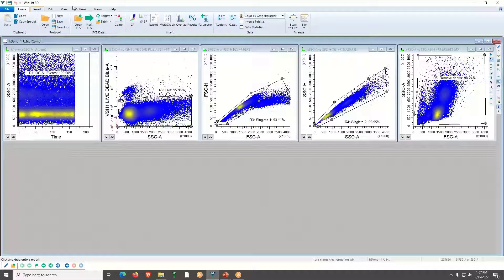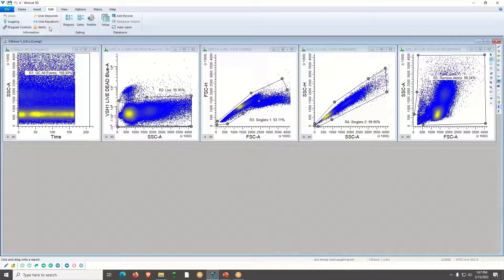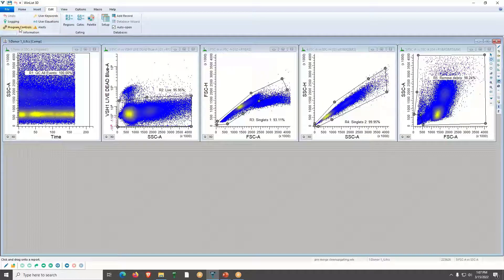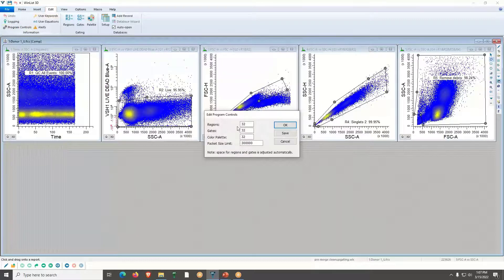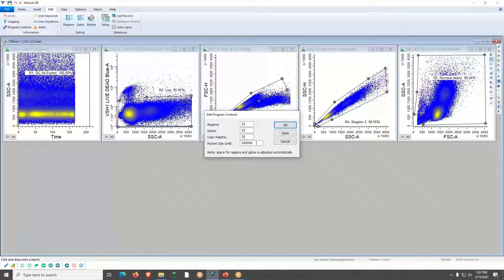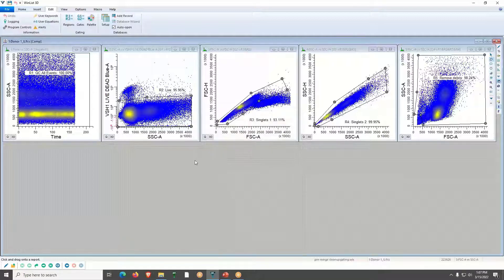Before starting the merging process, let me show you how to check the packet size. Go to the Edit tab, then Program Controls — it's simple to adjust. Just go to the packet size limit. I've already set this to 300,000 events because I'm going to downsample 50,000 events for each of my five files. I'll click OK.